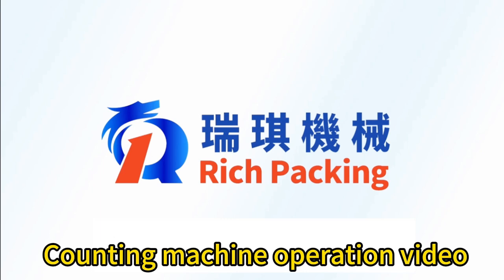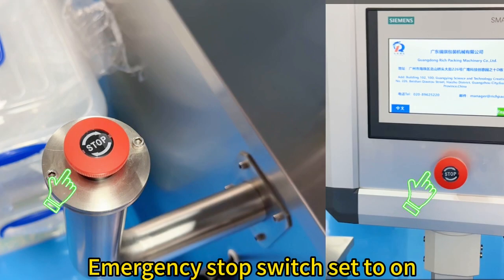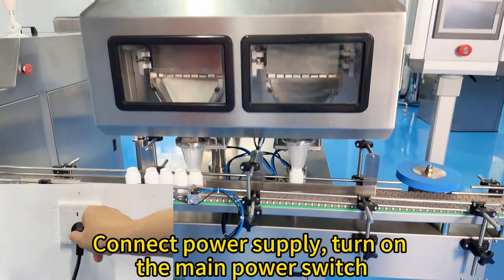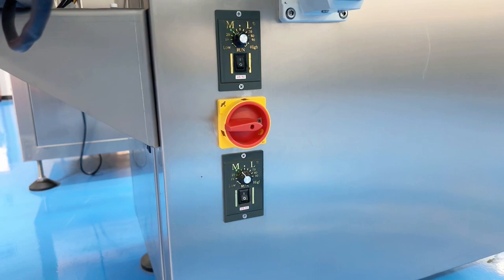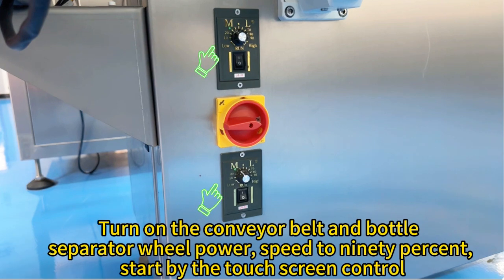Counting machine operation video. Emergency stop switch set to on. Connect power supply, turn on the main power switch. Turn on the conveyor belt and bottle separate wheel, power speed to 90%. Start by the touch screen control.